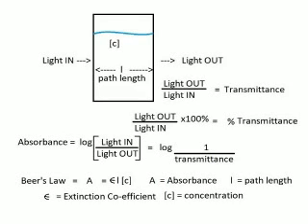So, you can tell the concentration of a species in solution by simply measuring how much light comes in and out and getting the absorbance. And for that, you can get concentration if you know the path length and the extinction coefficient of the species you are looking at.